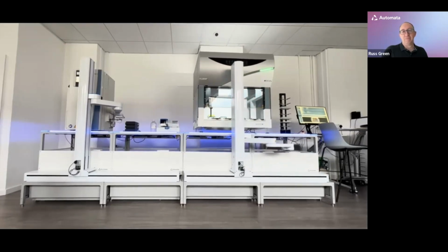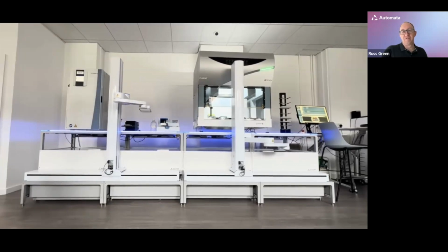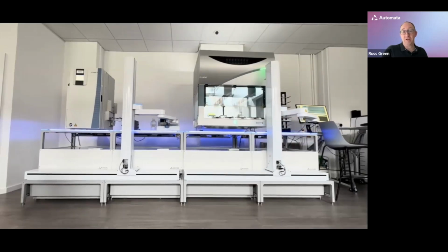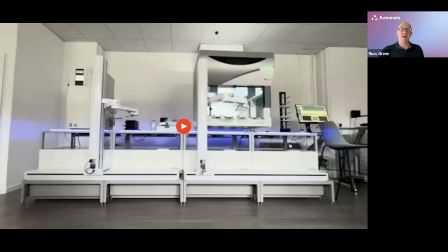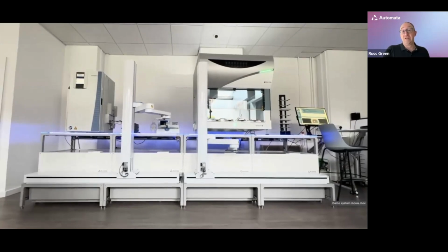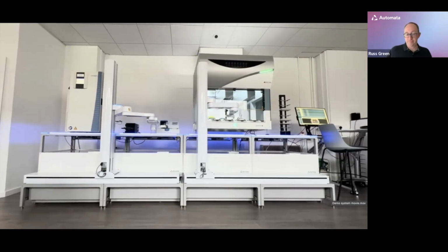automation for cell biology is absolutely possible, but we will make our lives a lot easier if we start going back to the first principles of that experiment, exploring whether, to hit the goals that we want to achieve, there are experimental changes we could make to facilitate that automation adoption. Thank you very much. And with that, I can take any questions.